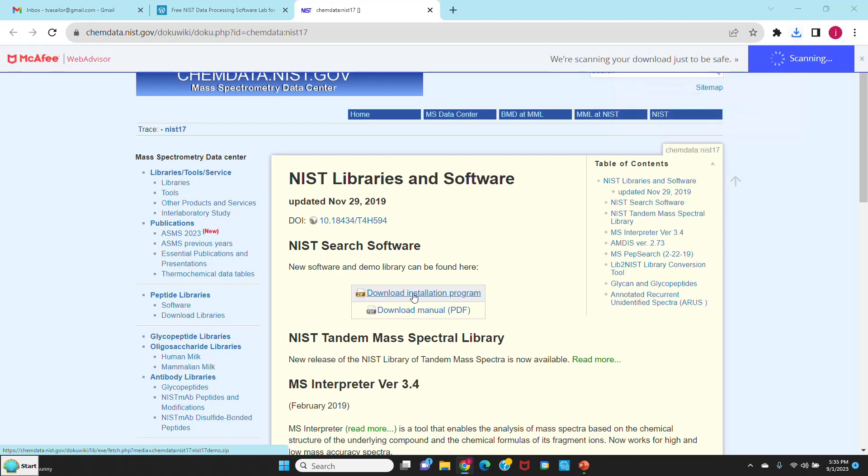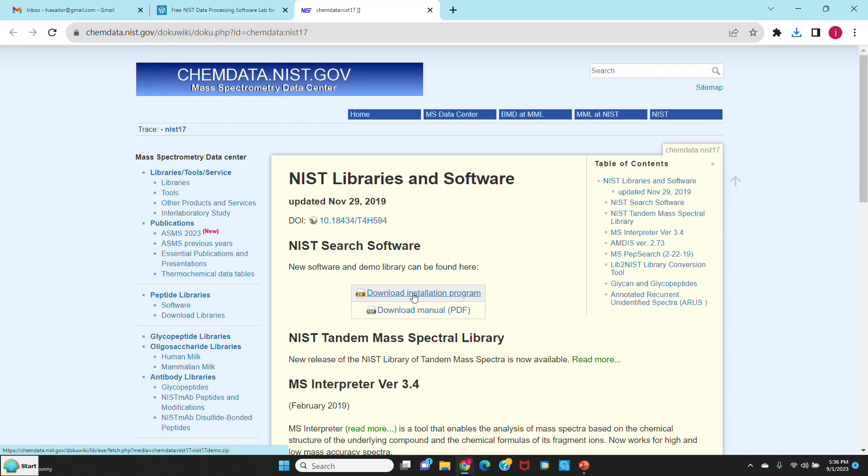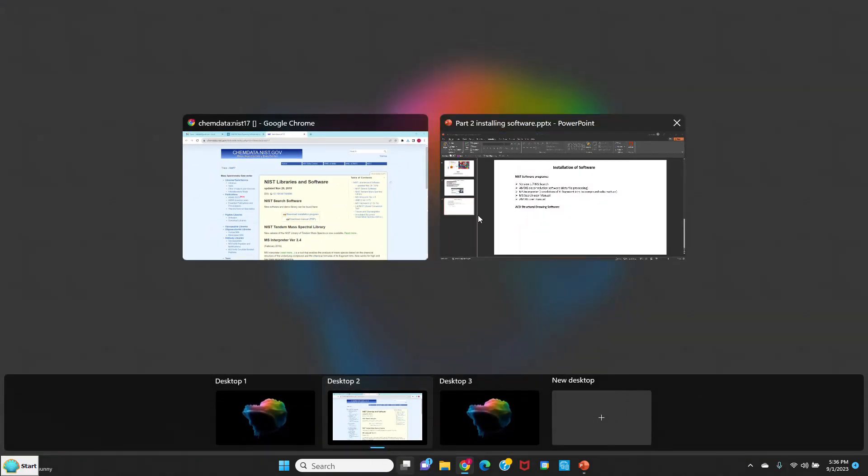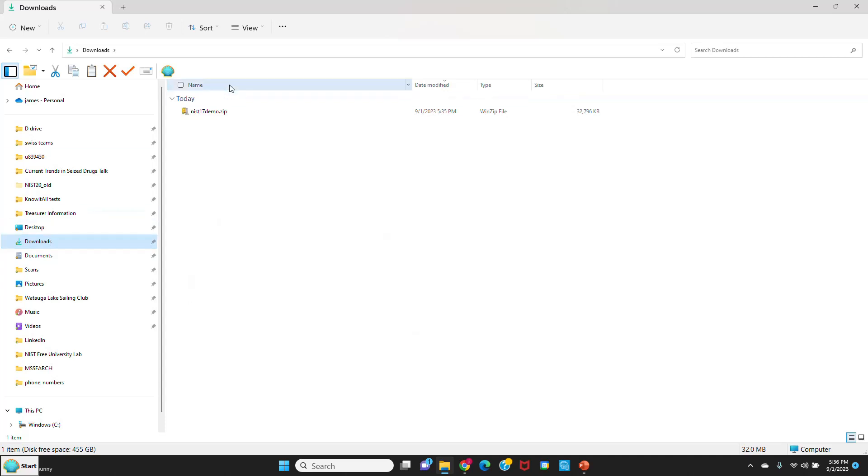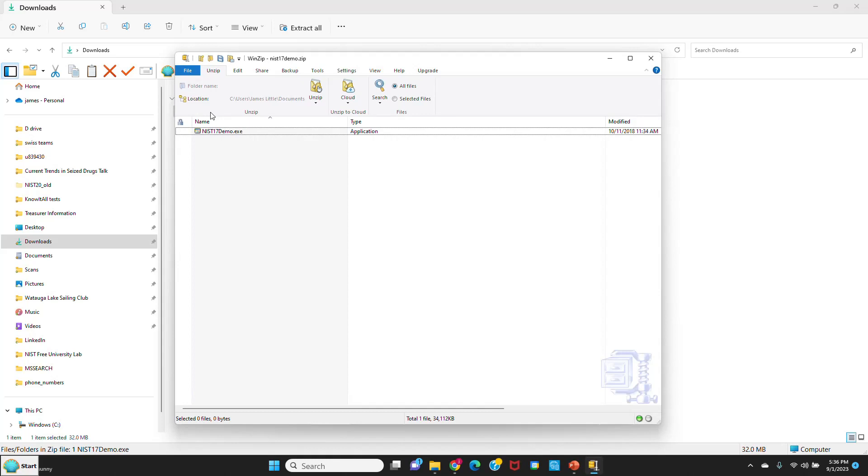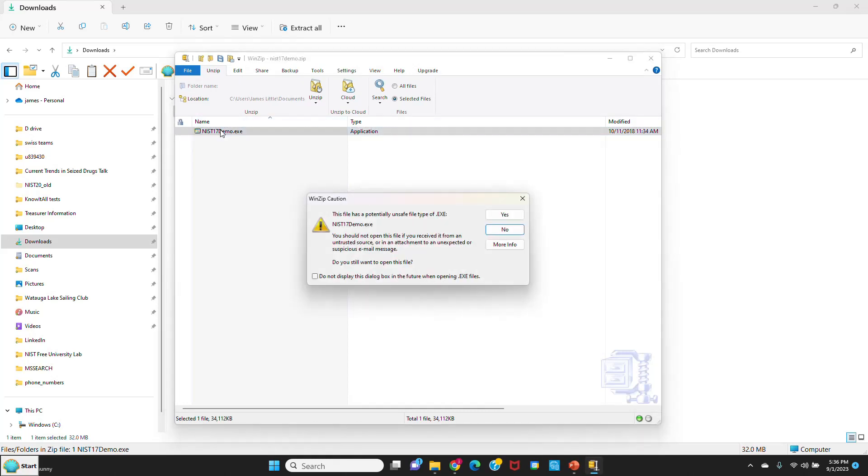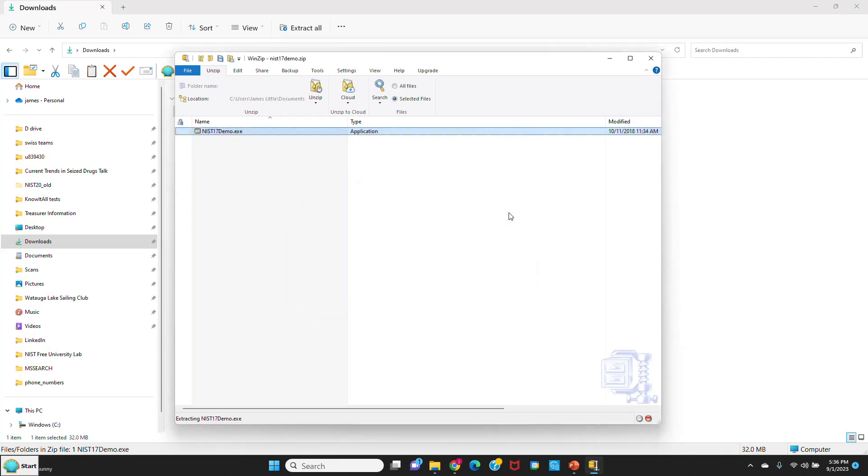McAfee is checking to make sure there's no viruses in the executable, and it should download to your download folder. So we'll go and open that up. I'll go to downloads and find NIST 17 demo. I'll double left click on it to open up the zip file, then double left click again. This warning says it could have a virus, but this program is from NIST and it has no viruses. So we'll just say yes and install it.